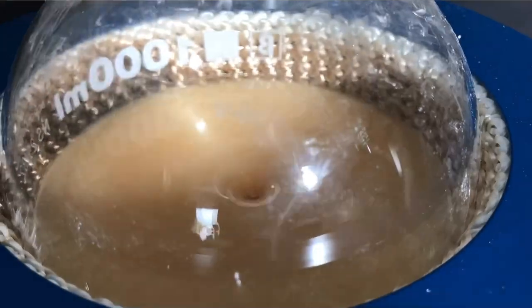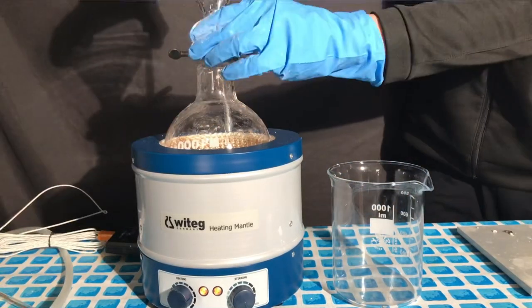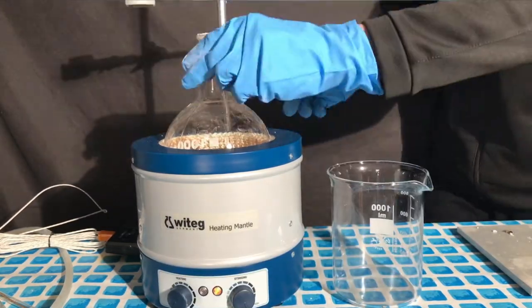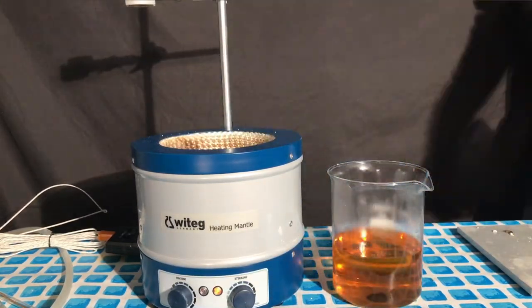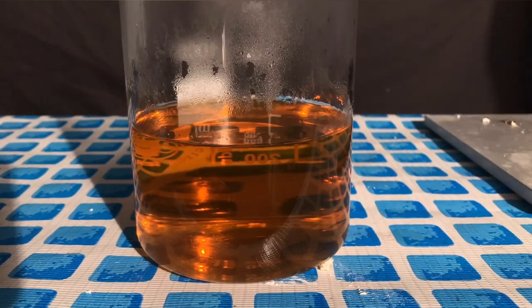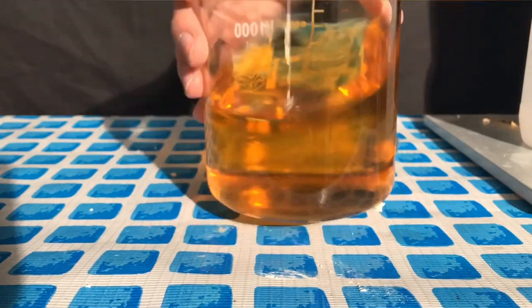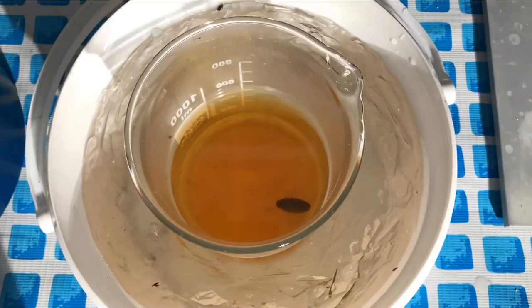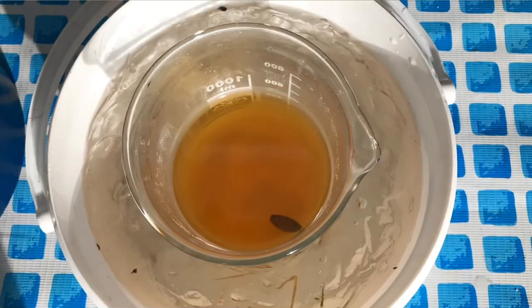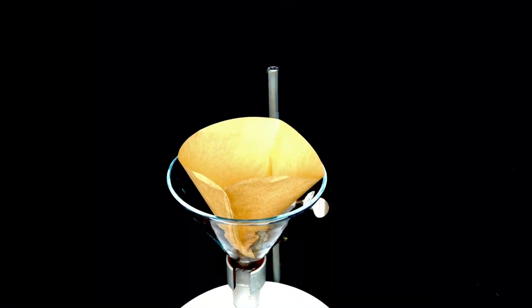The solution was heated until everything dissolved, and then we added about 150 milliliters of distilled water. Again, the distilled water acts to decrease the solubility of the acetylsalicylic acid. I first let the beaker stand in hopes that some product would crash out, but it didn't. Then I put it into an ice bath, and afterwards decided to put it into the freezer overnight. The next day after recrystallization, it looked extremely dirty — still unacceptable.